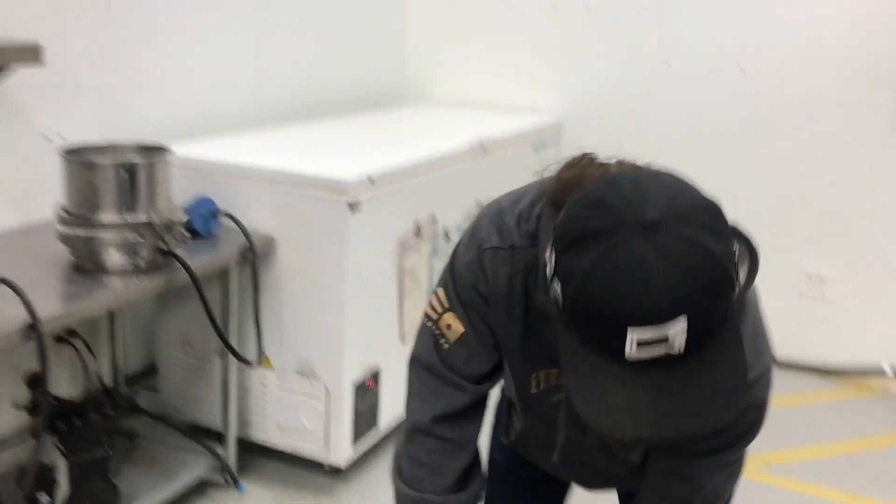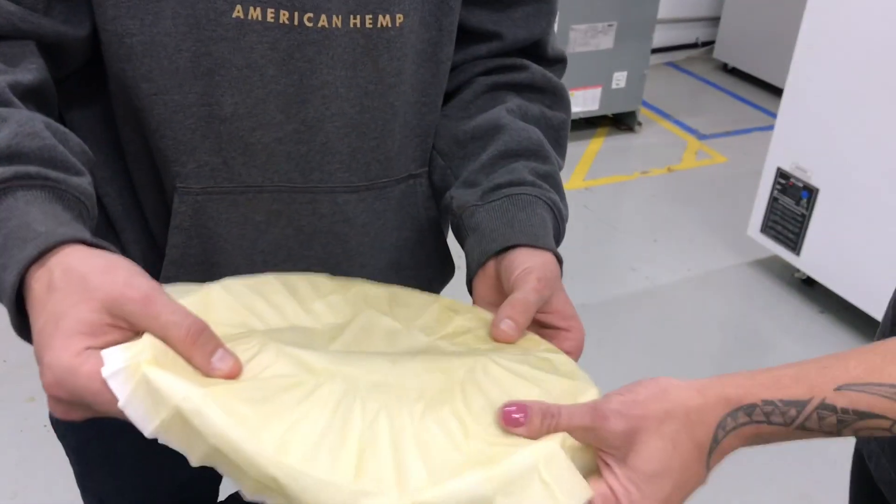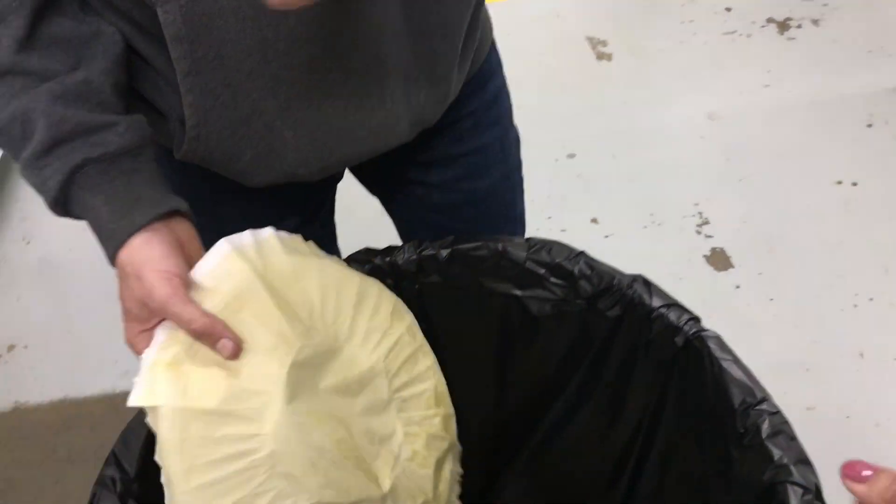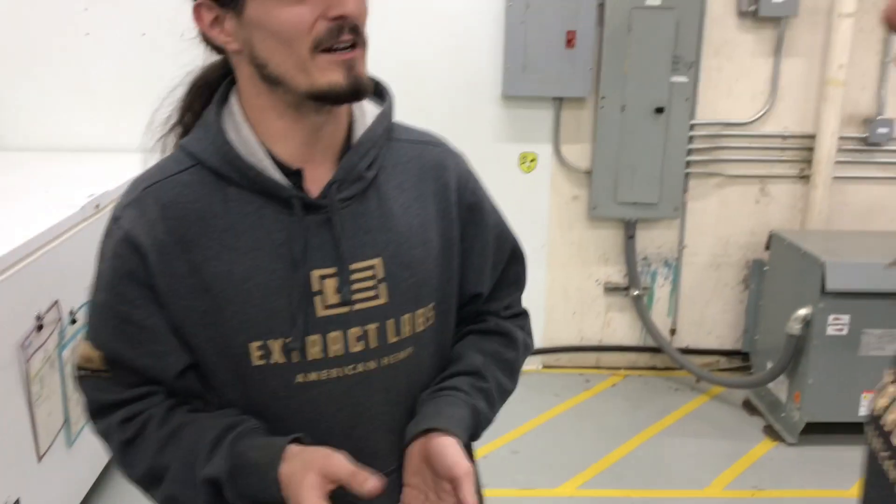There's not many waxes on here, but you can kind of feel some wax on there and it pulls it out. And then from here, that solution goes to the rotary evaporators over there.